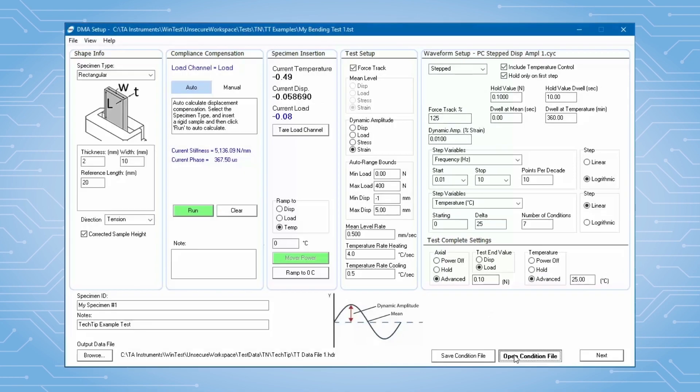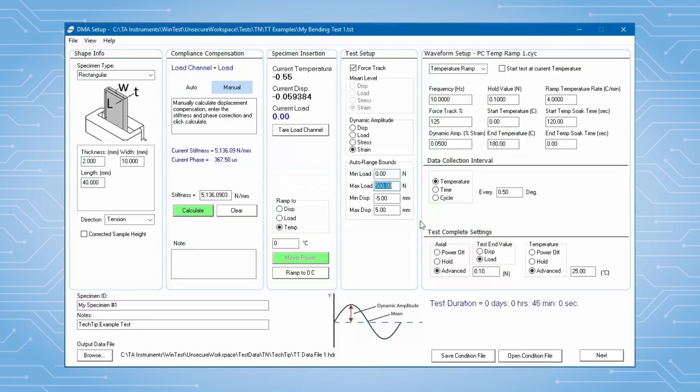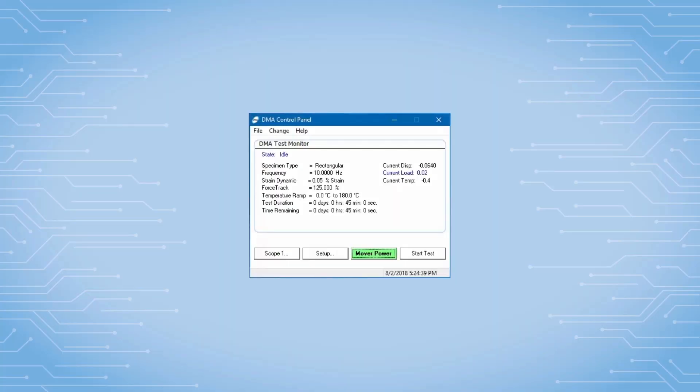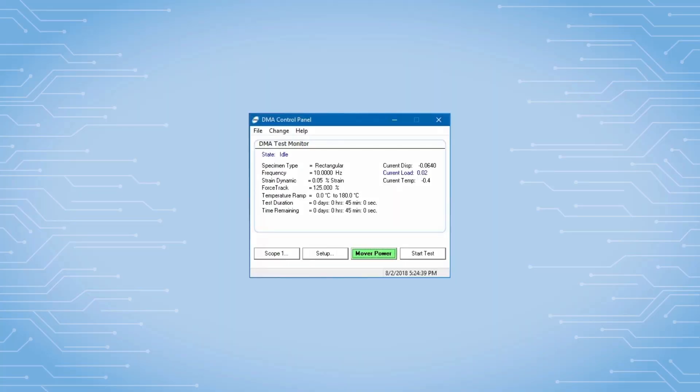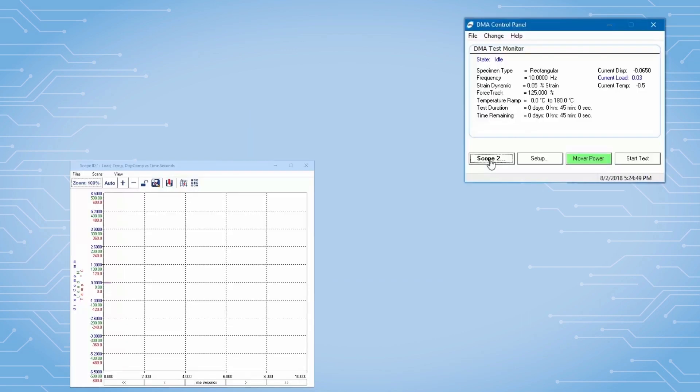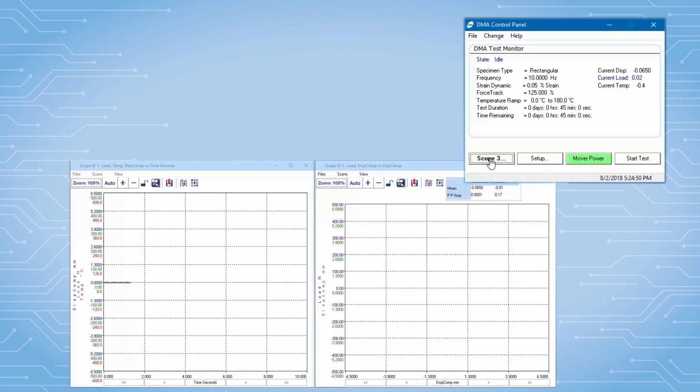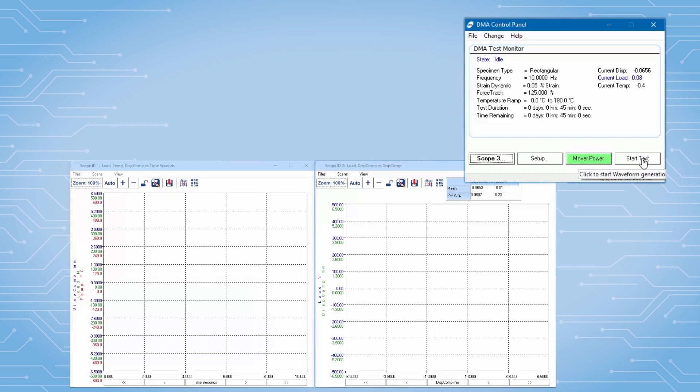I'll reload the temperature condition file and execute this test. The DMA control panel allows me to start and monitor this test. I will show a couple real-time scopes to allow me to observe the raw data during the test.